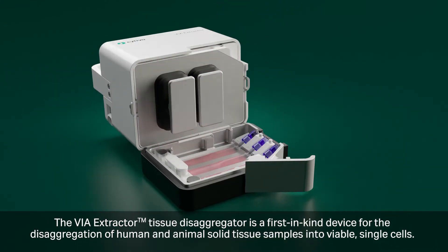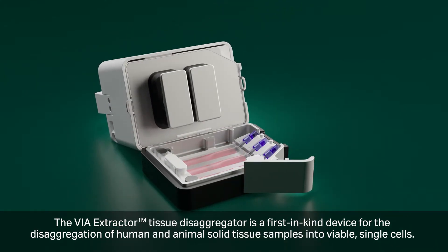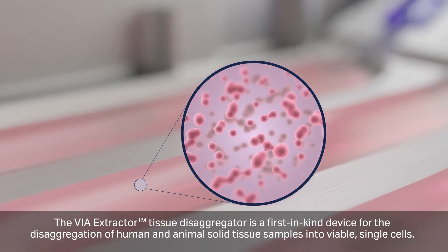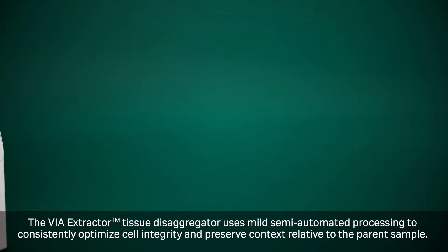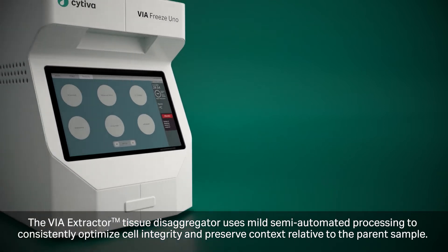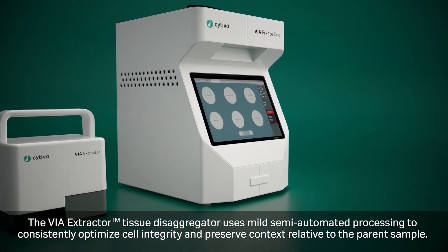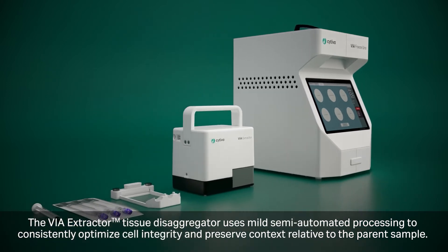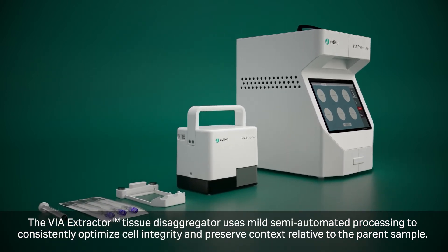The VIA Extractor is a first-in-kind device for the disaggregation of human and animal solid tissue samples into viable single cells. The VIA Extractor uses mild semi-automated processing to consistently optimize cell integrity and preserve context relative to the parent sample.